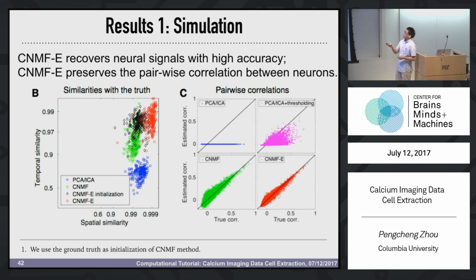We also see that most PCICA traces have large Gaussian white noise. We think that maybe if we threshold the value of these traces at 3 standard deviations to remove the Gaussian white noise, and only keep the calcium transients, maybe we can get a better estimation of correlation.